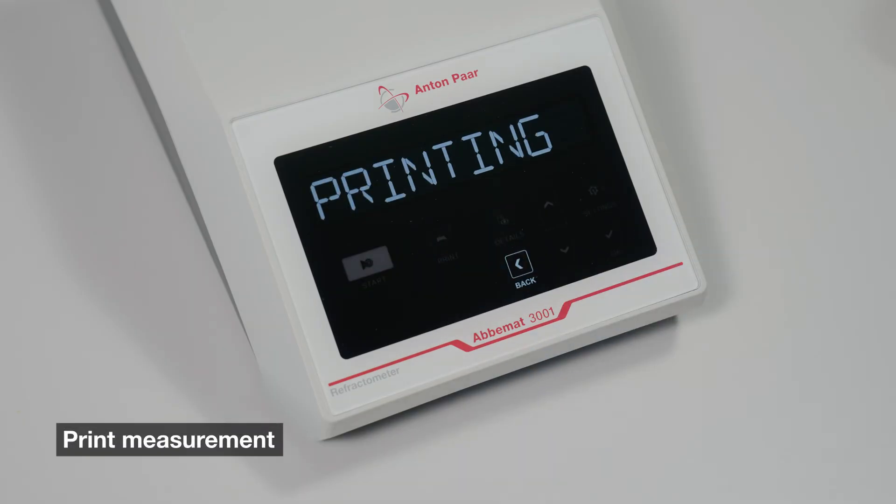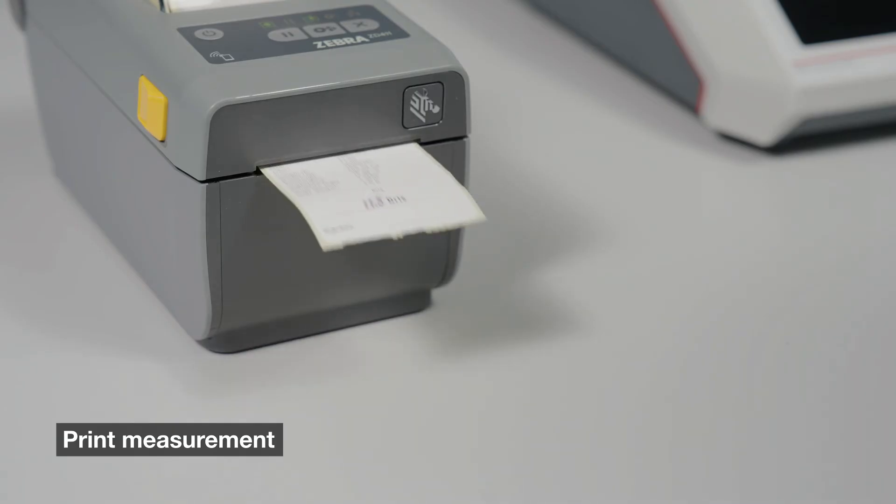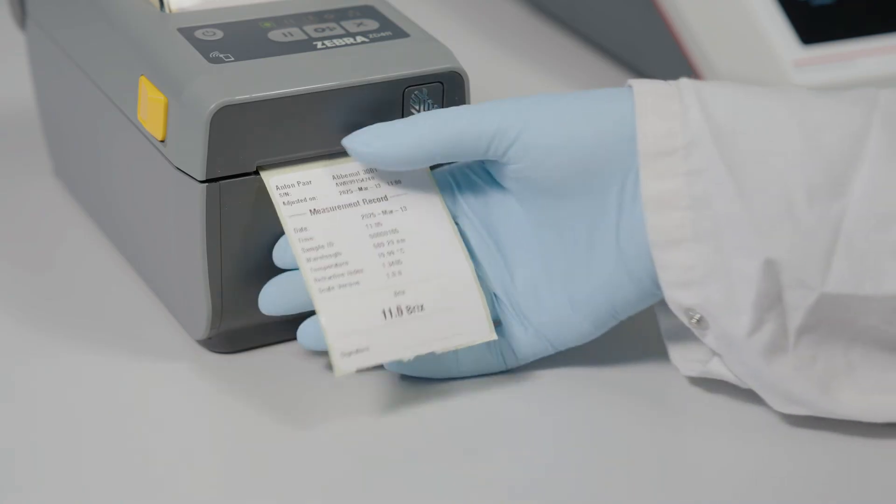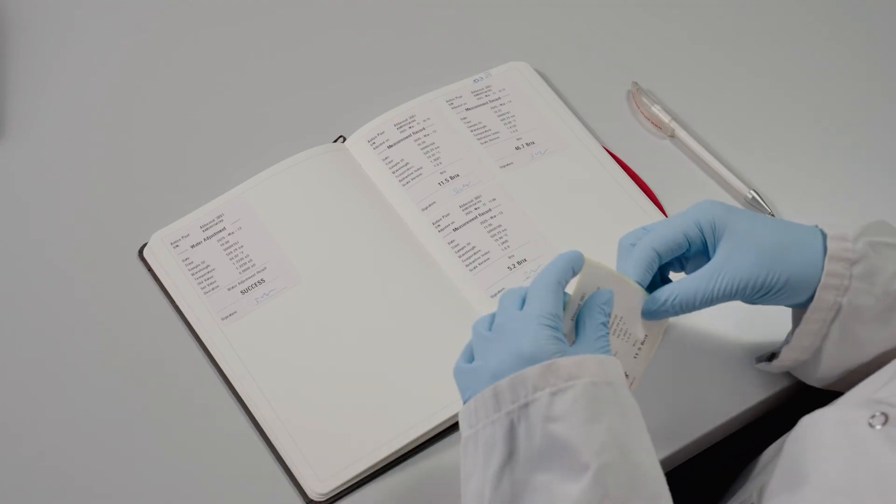Press Print to print the result. The result can be printed out immediately and pasted into the laboratory book for error-free documentation.